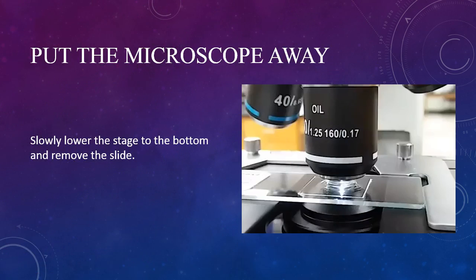After we've made our observations and finished our work with the microscope, we still need to put it away. We begin by using the coarse focusing knobs to lower the stage. Go slowly, just in case you go up instead of down — you can catch it before damaging the lens or the slide.